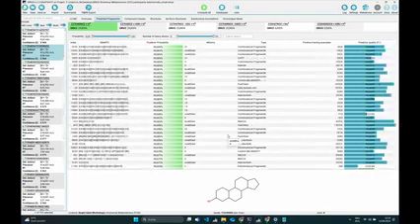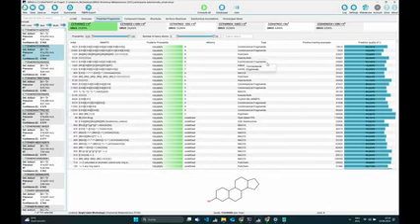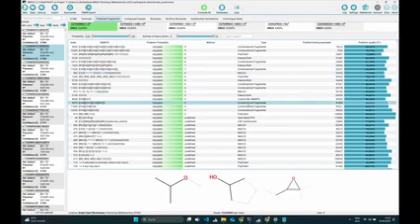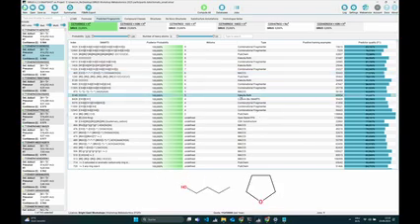There are well-known fingerprints, for example from PubChem or Klekota-Roth or MACCS or also ECFP. And there are also additional combinatorial molecular properties, not fingerprints, that we derive from our training data. We take our training spectra, do combinatorial fragmentation on them, and build properties that match these fragments. So it's a big mix of different molecular properties.